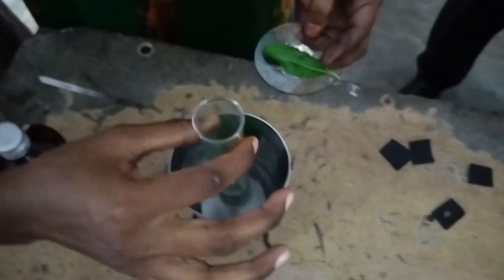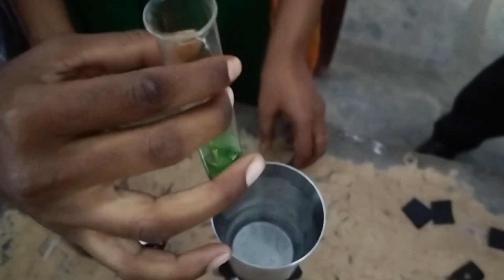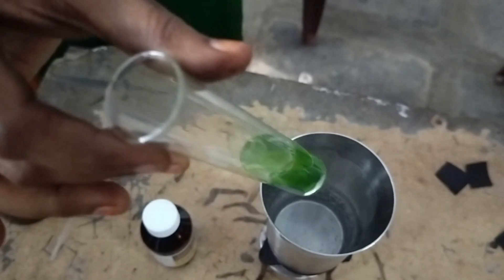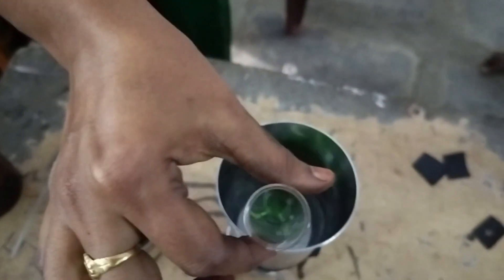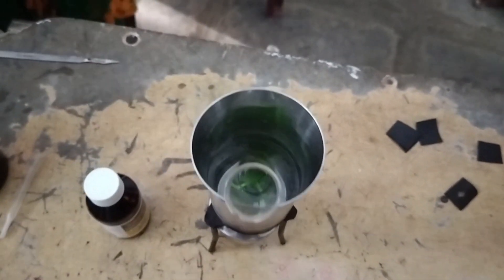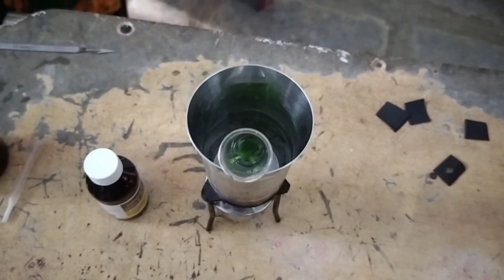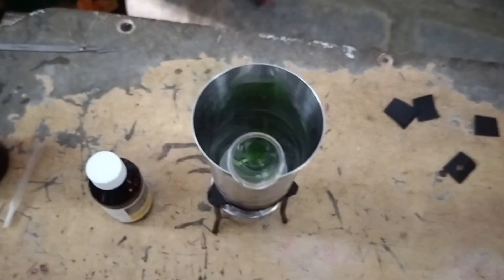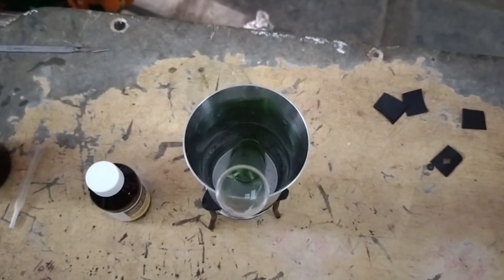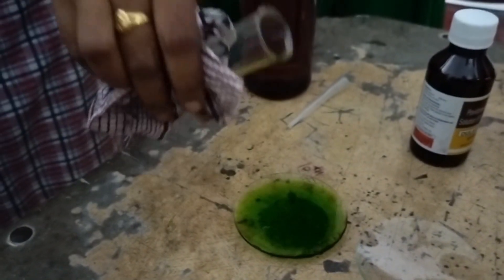Now keep these leaves in spirit. We took spirit in a boiling tube. Make sure that the leaves are immersed in methylated spirit like this. Keep this boiling tube in boiling water. Boiling water boils the methylated spirit, which dissolves the chlorophyll present in the leaves. See the colour of the methylated spirit turn to green — that means the chlorophyll has dissolved in the methylated spirit.